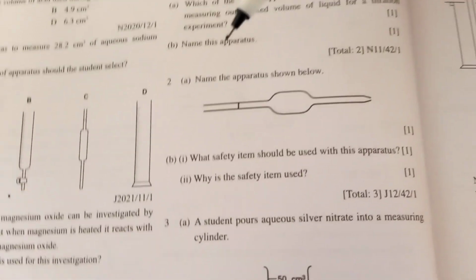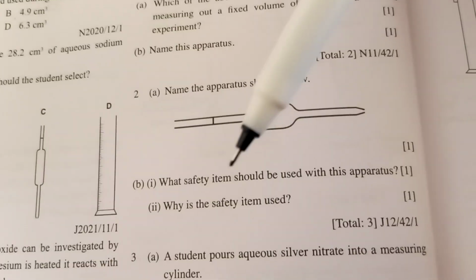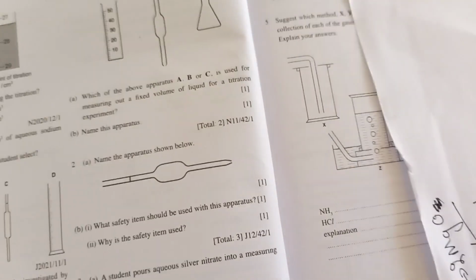Name the apparatus. This is a pipette. What safety item should be used? A pipette filler.